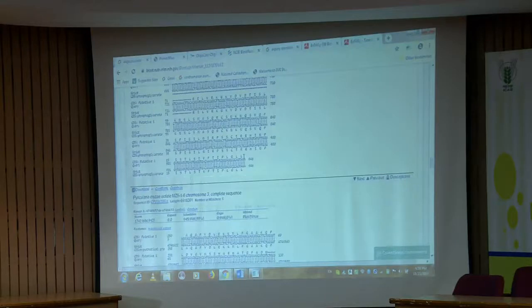So you go with this format while you are doing the BLAST of this nucleotide, then select this option for CDS, so that simultaneously you can get this also, and finally you can match and pick the correct translate, and then you can make your document for that. Got it?